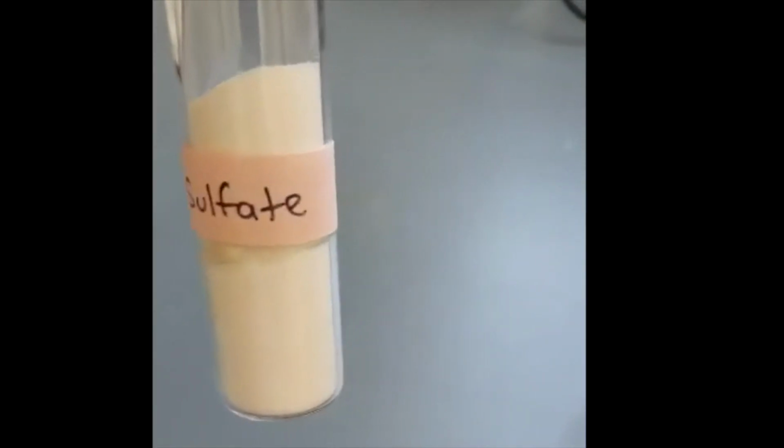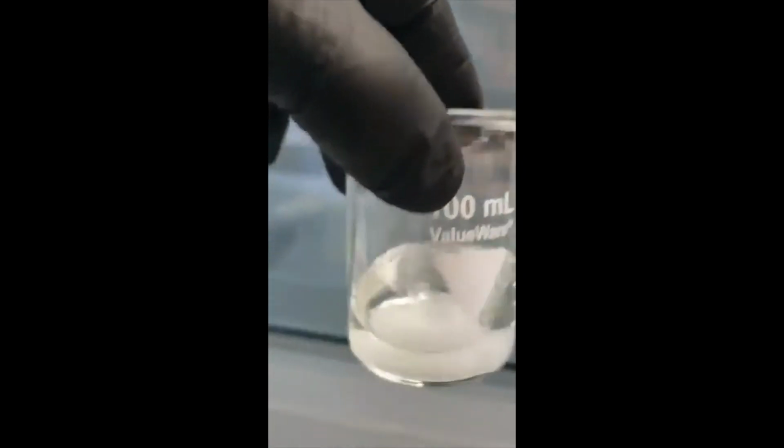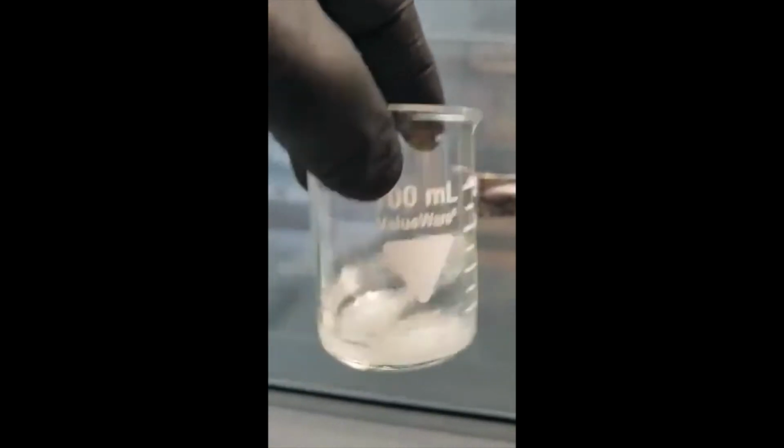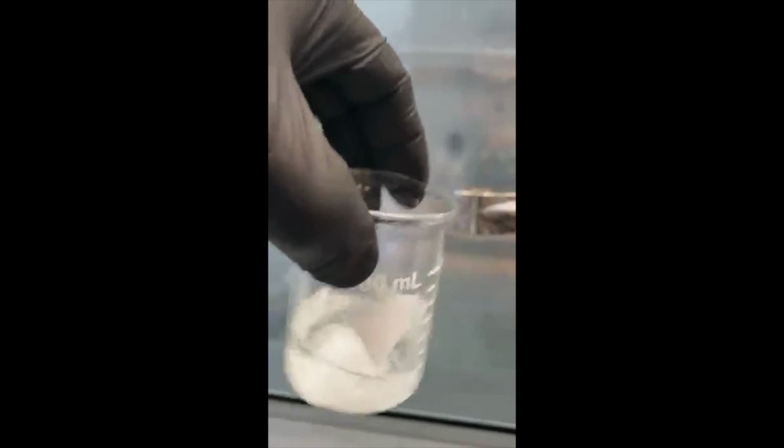Weigh out approximately 2 grams of sodium sulfate onto weighing paper. Pour it into your methylene chloride fractions. Mix it up, stir it around, jiggle it, and then let it sit for about 15 minutes. The sodium sulfate is going to sequester and bind to any water that may be around from that top layer of your extraction.